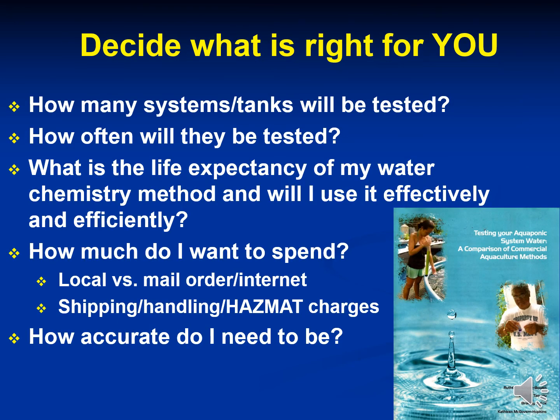It really depends on how many tanks or systems you need to measure. Chemical test kits are great if you're measuring just a tank or two, but if you have multiple tanks or systems, you may want to invest in more expensive meters. It also depends how often you test, how long will the test method last while still being effective and efficient, and how much you want to spend without compromising accuracy.